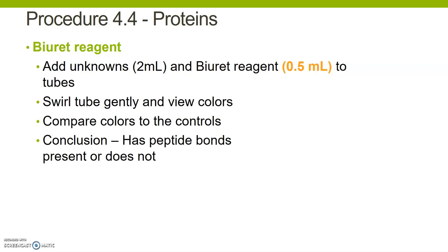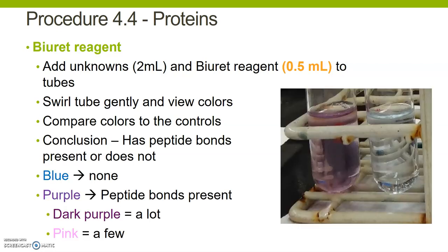So let's take a peek again at those controls. So here we have our positive control on the left. Right, so it turns a purplish color. Now again, remember, the darker the purple, the more peptide bonds that are in here. So this is a relatively light purple. There are not that many peptide bonds in this solution.